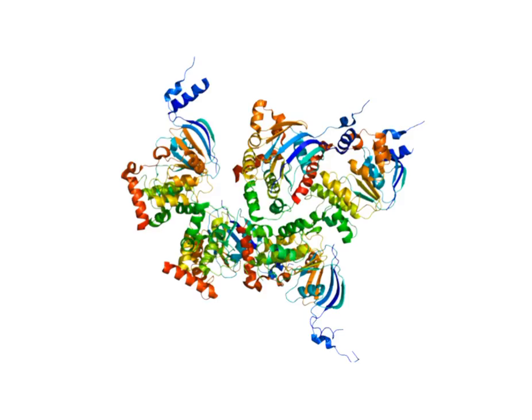Alright, this video is your pre-lab video for your PCR crime lab. What we have right here is the CFTR protein. It is a transport channel protein that is found in lung tissue, on lung epithelial tissues exactly.